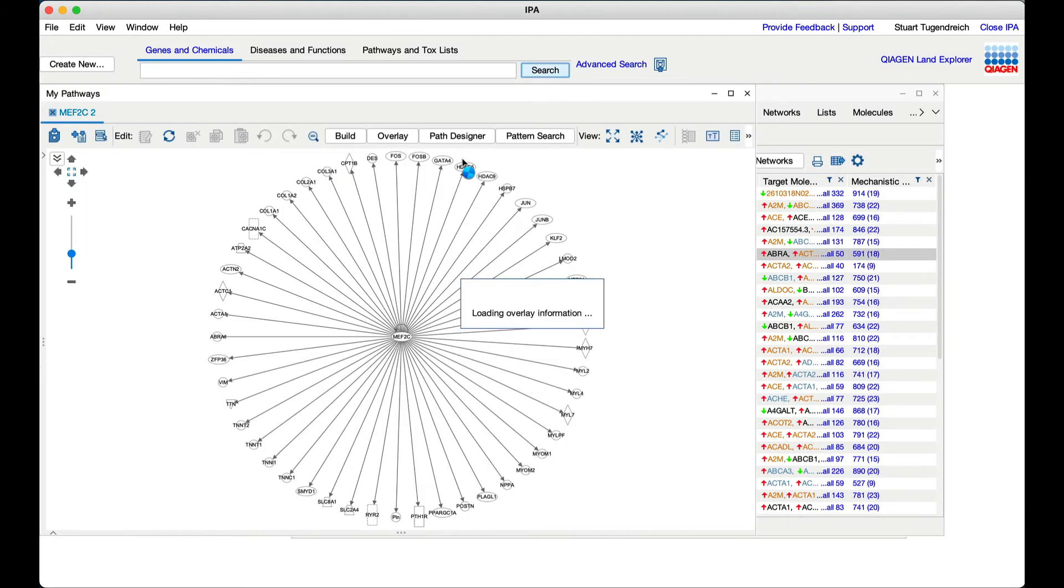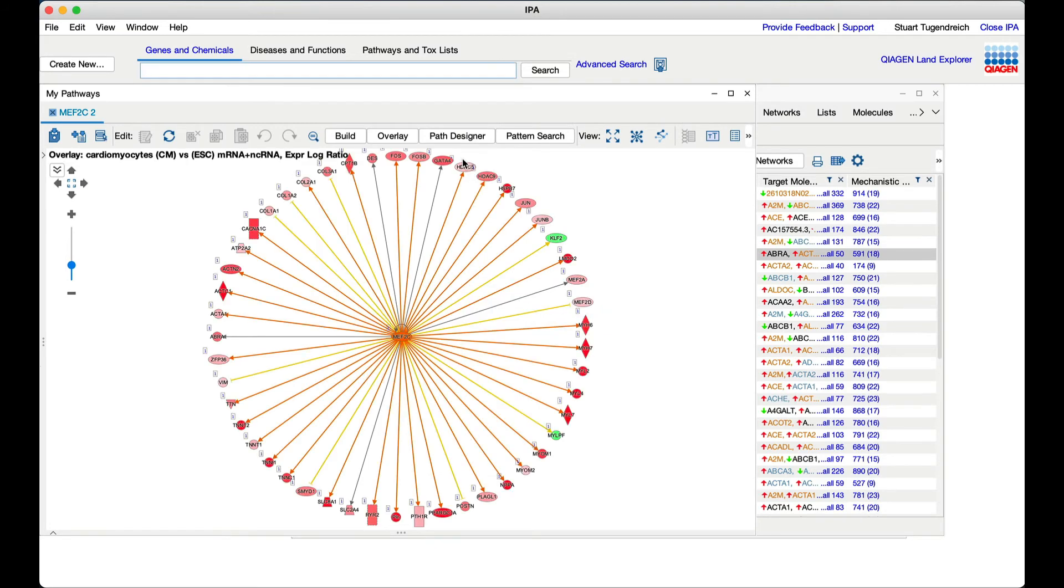Let's pick the transcription factor MEF2C. It is shown as a network with the dataset targets arranged around it.